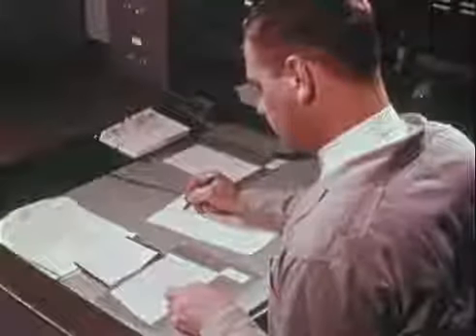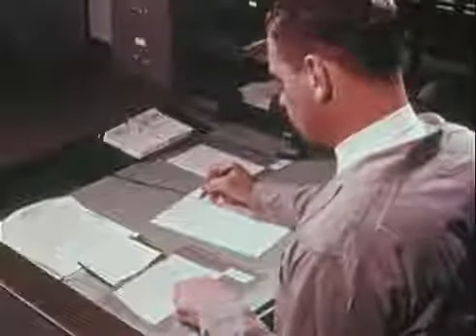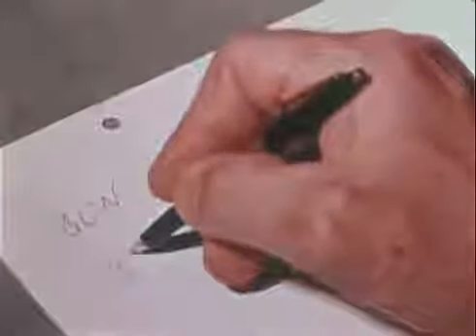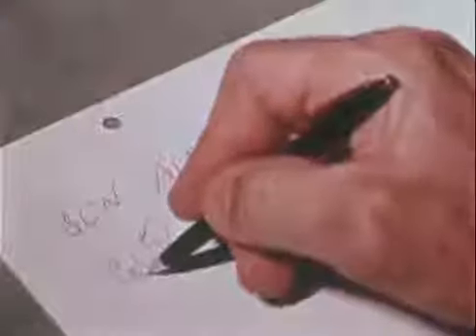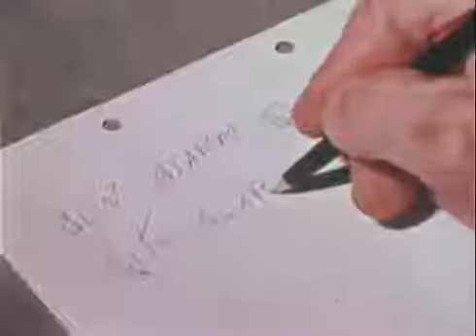He copies onto his worksheet letters which appear to have significant characteristics. This keeps the evidence free from undue handling or marking. He marks those from the file known and those from the evidence questioned. As in handwriting examinations, he looks for matching and recurring characteristics: letter formation, placement on the line, spacing, direction of stroke, and others. Although block printing has fewer signposts than handwriting, those that it has are obvious to the expert document examiner. And bank robbery notes, unlike check signatures, usually provide an adequate sample for comparison. Each similarity is ticked off with a straight arrow.